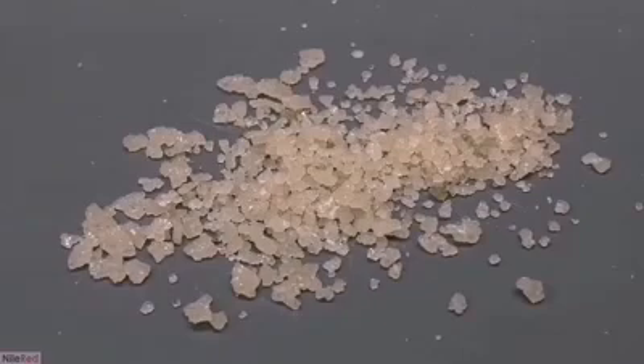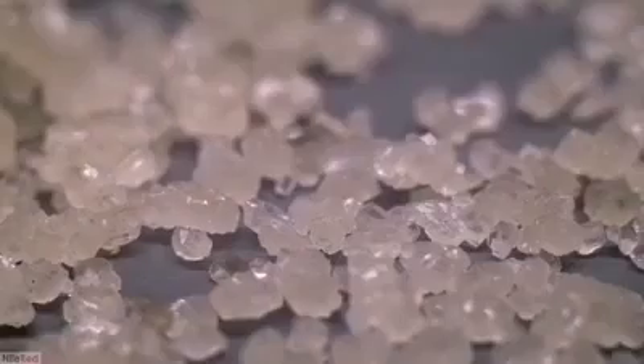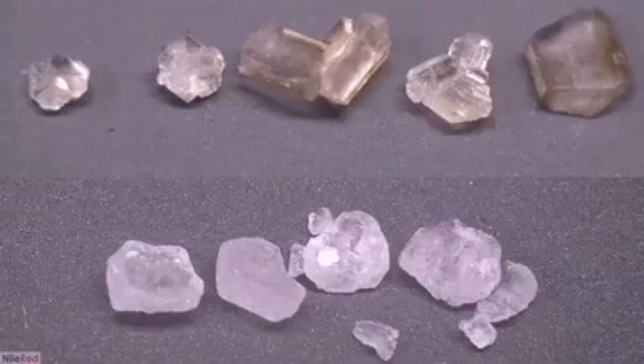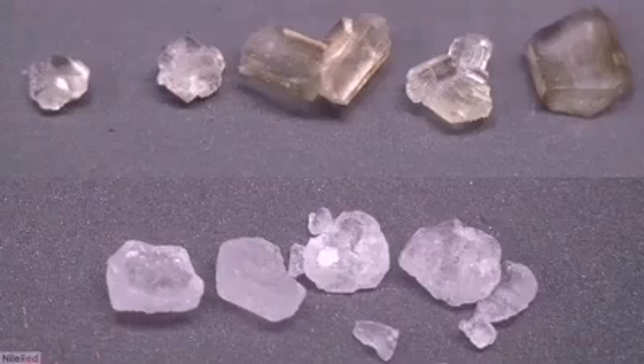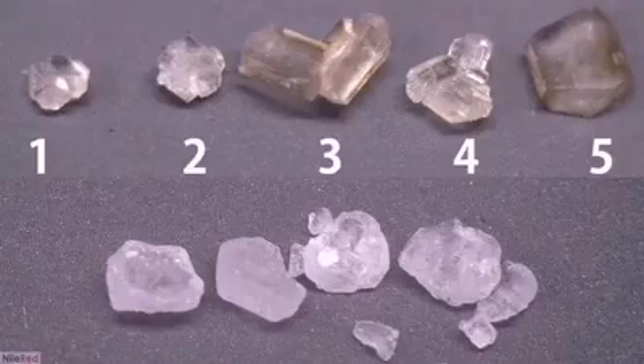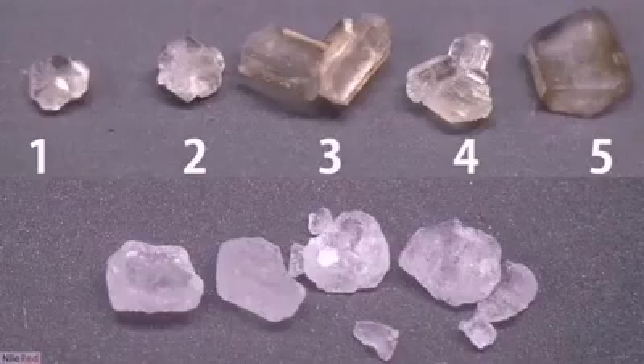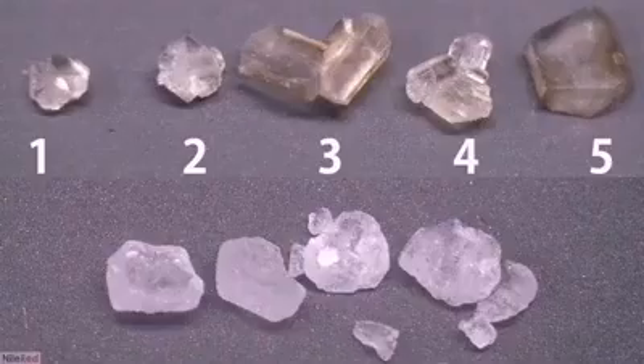Just for fun, I'm going to take a closer look at the crystals. Using a cheap lens, I was able to get some decent shots. I picked out five crystals and lined them up — you can see their structures are quite different. I've also taken a shot of pure citric acid for comparison. Crystals 1, 2, and 4 look very similar to pure citric acid, but crystals 3 and 5 are quite different and I think they're actually impurities. They look extremely different from the typical citric acid crystal, and they're significantly discolored.